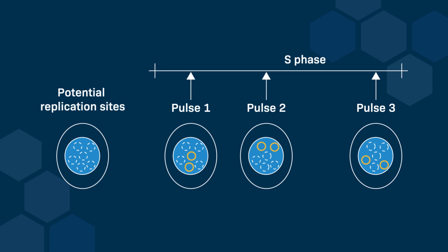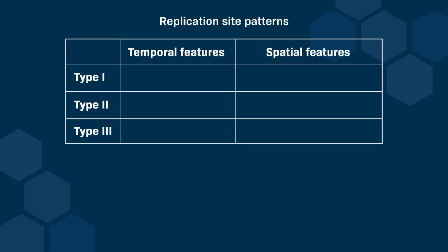In these experiments, a BrdU pulse in S phase showed active replication sites after a 10-hour chase. This confirmed that not only can the sites be visualized, but software can also be employed to calculate the number of active replication sites or replication signals that were active during a specific time frame in an experiment. So, what did the patterns of replication sites reveal in this experiment?